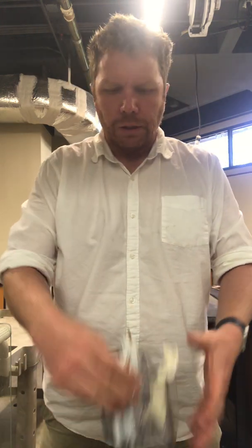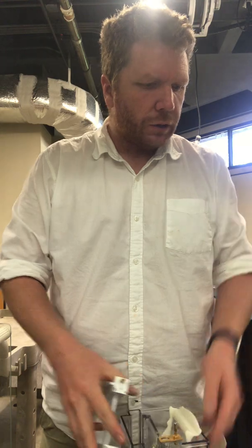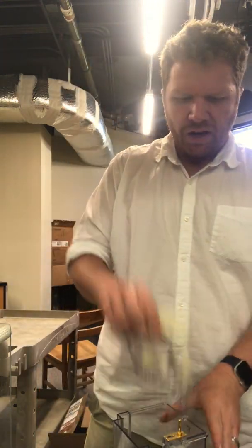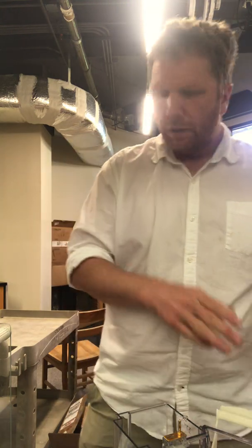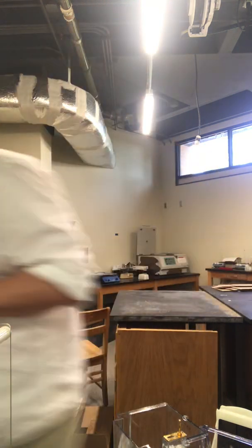All right, so I've got my gel rig all set up. I've got the buffer dam, I've got the gel, and then I've got this locking apparatus. Now, I need to open the gel.